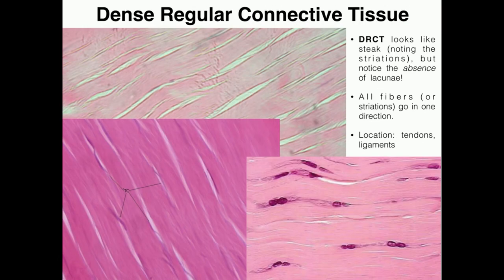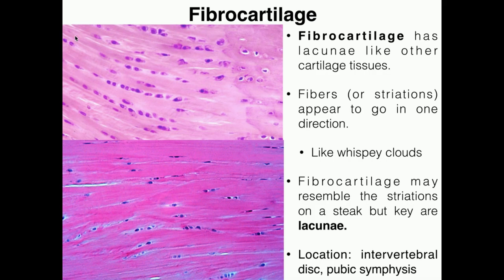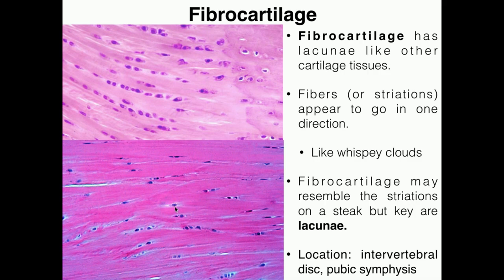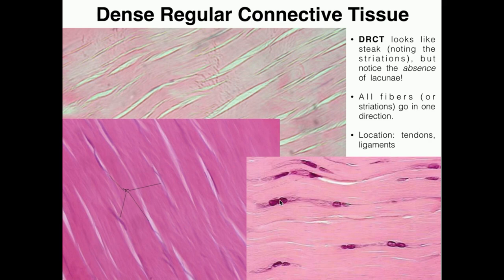Let's look at the last one: dense regular connective tissue. This looks very similar to fibrocartilage. In fibrocartilage we have striations, and we also have them in dense regular connective tissue. All of these striations go in the same general direction — in the bottom left they're going diagonally, in the right one they're going horizontally, in the top picture they go at an angle. You may see some cells here, but these are not chondrocytes in lacunae. These are just simple fibroblasts — they don't have the white surrounding that lacunae have. You'll typically just see them as purple blobs without a light region around them. So these are not lacunae; these are just fibroblasts.